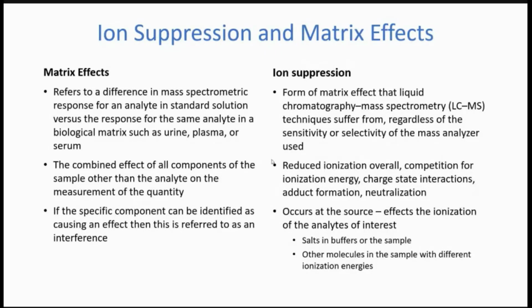If you purchase a standard, put it in pure solvent and run it through the system, you'll get one signal. Often once that same standard is in something more complex like urine or saliva, you're going to see a change in the signal, even if you spike it in and you know exactly how much is supposed to be there. So that's a matrix effect.